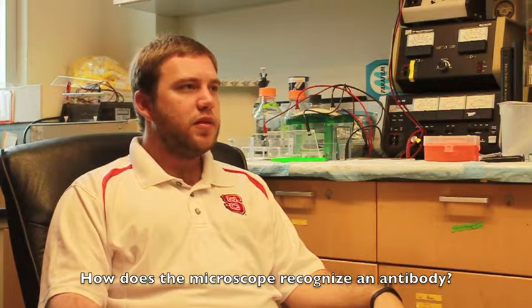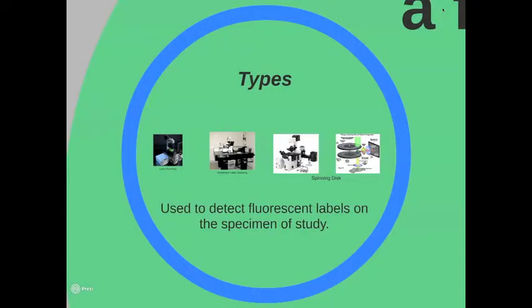How does it recognize the antibody? Because you said that it focuses specifically on that. How does it do that? It's not that it focuses on the antibody per se, but the antibody has what's called a fluorophore conjugated to it. So on the end of an antibody, there's a little fluorescent molecule. And so the antibody is going to bind your antigen, whatever that protein may be, and then the fluor, since it's attached to the antibody, will stay bound as well. And that way you have just the protein you're interested in lighting up.